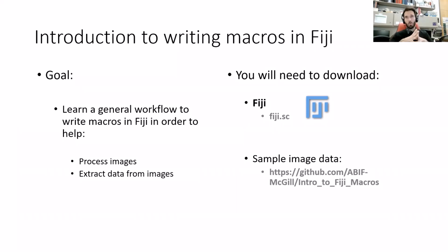In terms of the whole data acquisition process, you prepare a sample, you go to the microscope, you get some images, you do some image processing, you do some data extraction, some analysis, and eventually get to a plot that you can put either in a talk or a paper. There's a lot of stuff going on, and we're going to be focusing on the middle part, once you've already acquired images and before making a plot.